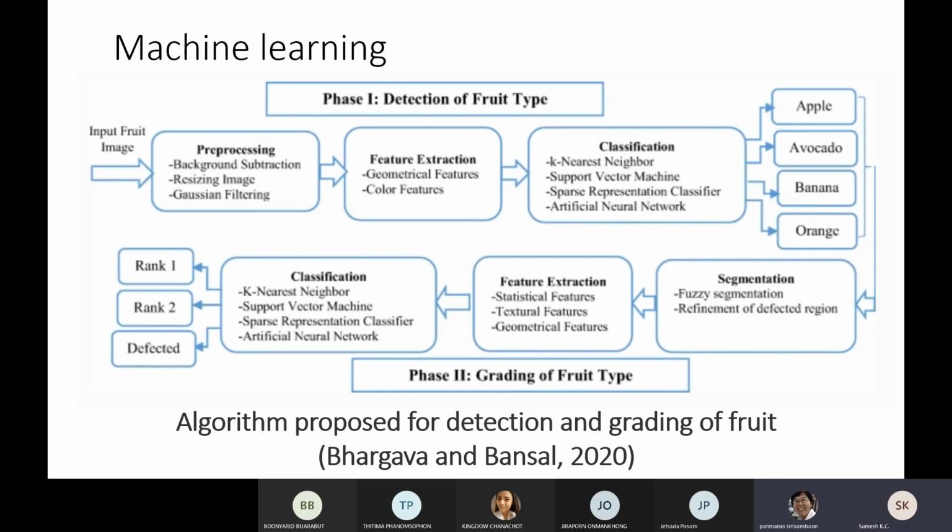Like what you said about the feature extraction, the geometrical feature. For her, she doesn't take the image. She has the spectra. So what she can do in this feature extraction part is use wavelength selection or PCA.